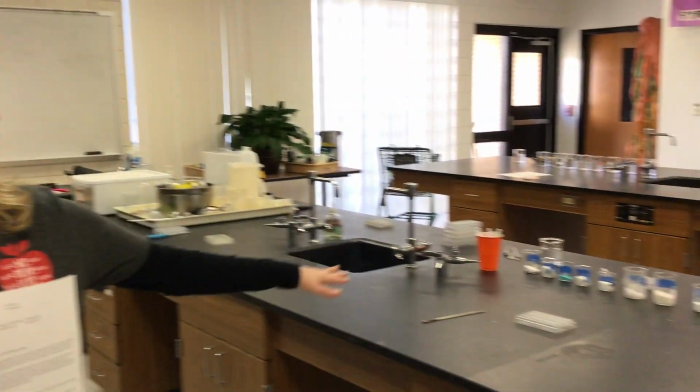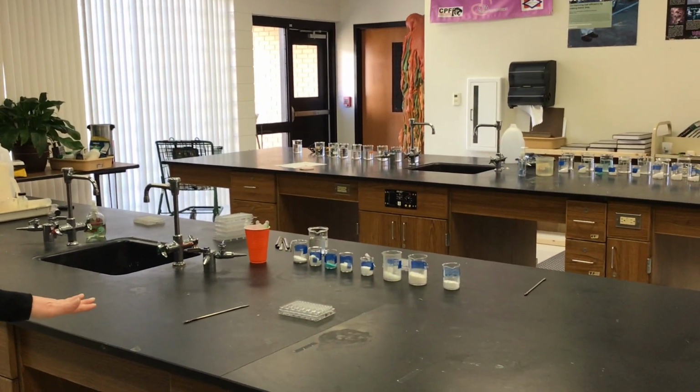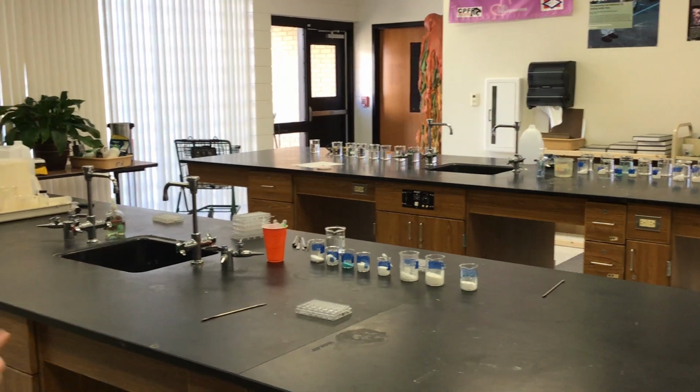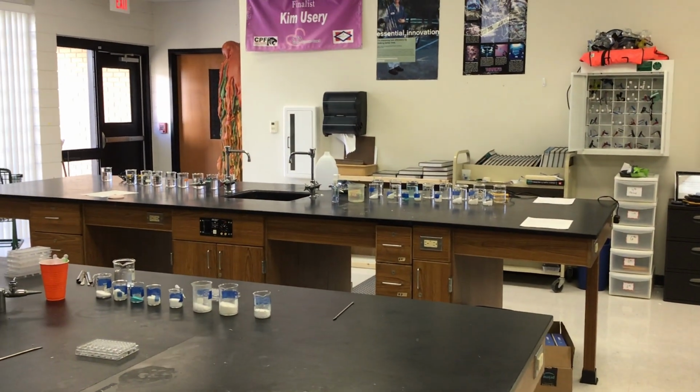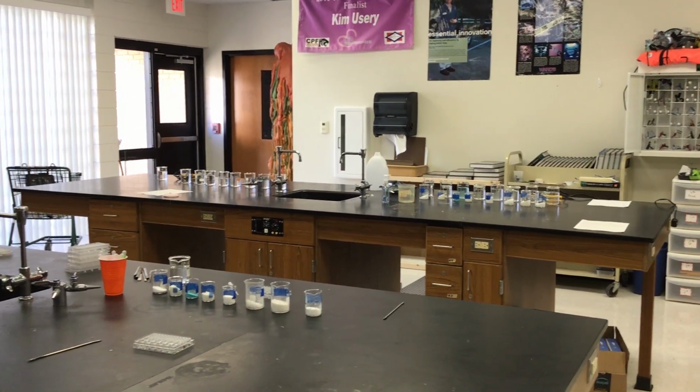Then we're going to move over to the station on solubility, and we're going to use a well plate and see whether or not it dissolves in water. Then the final station is we're going to have some solutions already set up, and then we're going to see whether or not it conducts electrical current. The final part of what you're going to be doing is going to determine whether or not it's ionic or covalent based on its properties.